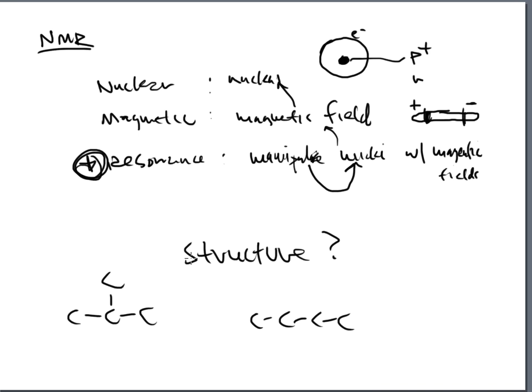to tell us. Now, this is another form of spectroscopy, all right? And a lot of people get confused here because spectroscopy is the world of UV, it's the world of infrared, it's the world of mass spec, it's the world of AA, AE, and ICP. All right, well, what that means is that a UV uses a light bulb in order to do a job.